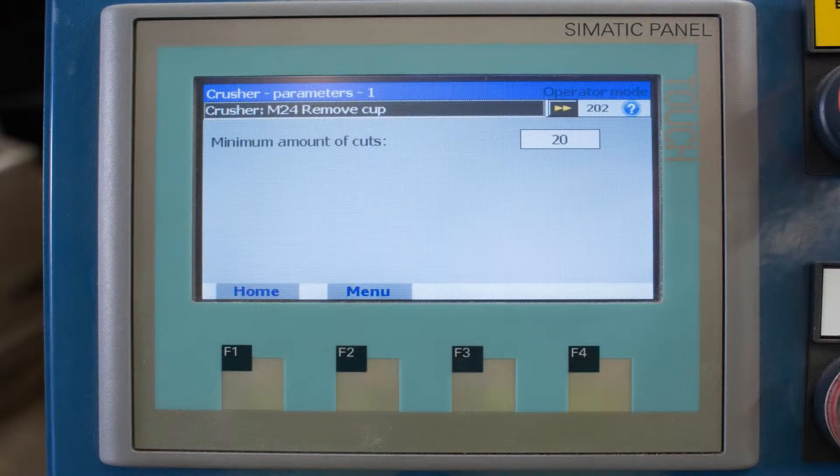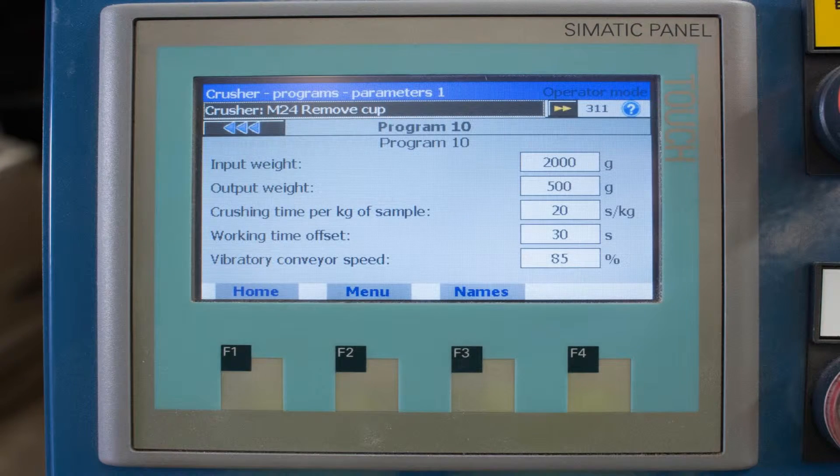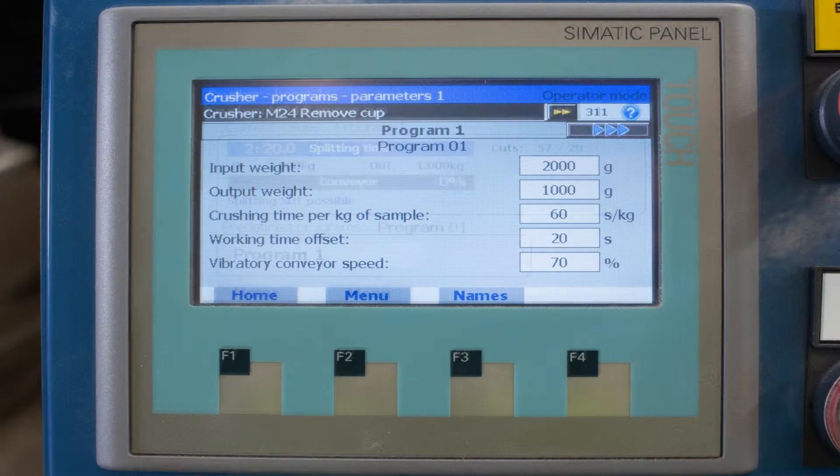The splitting ratio, number of cuts, and all other process variables are easily adjusted by the user on the built-in touchscreen control panel.